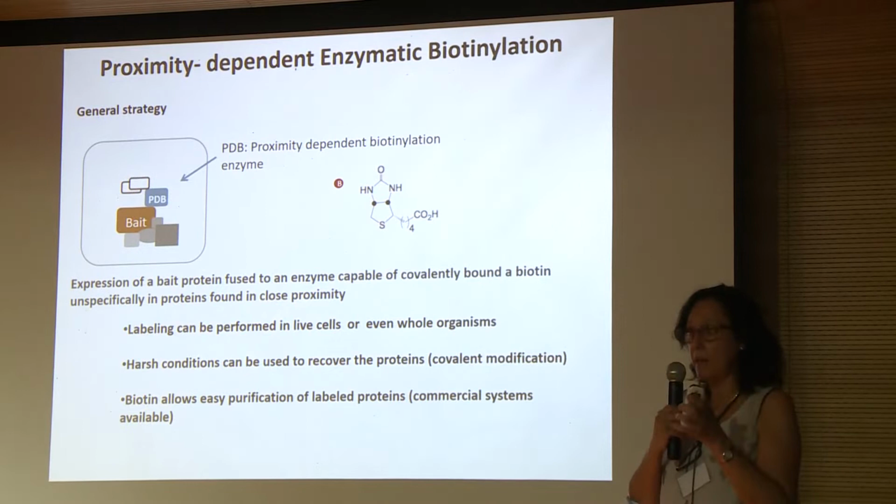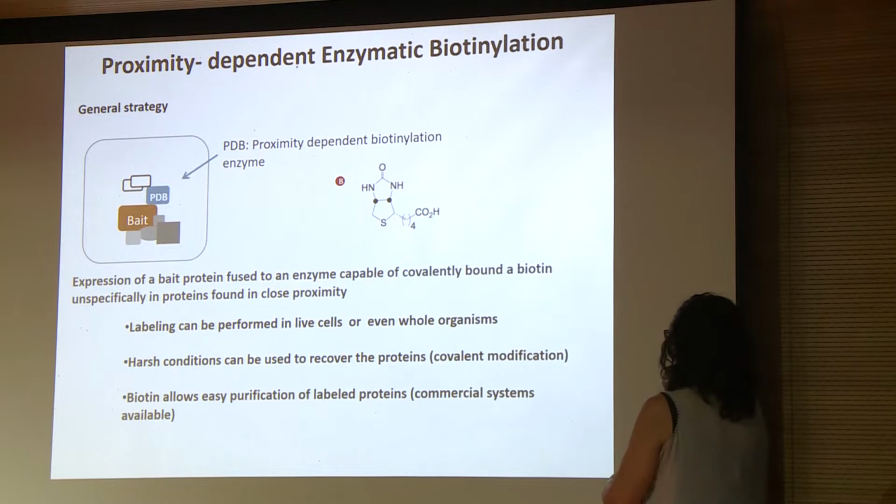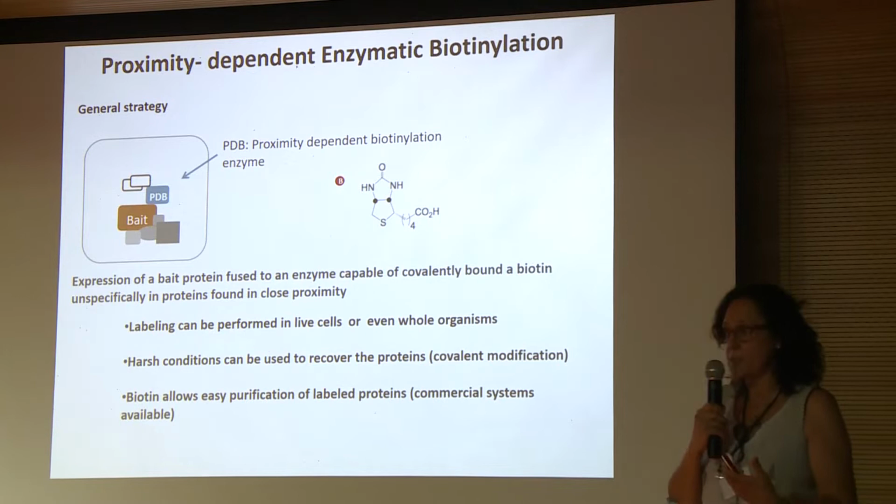You can use very harsh conditions to recover proteins, to wash your sample, to have cleaner and less background, because your modification is going to be covalent. And you will also introduce a biotin. That is very convenient, because there are many commercial systems that are devised to recover and to purify biotinylated proteins.